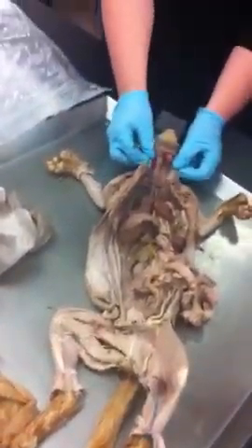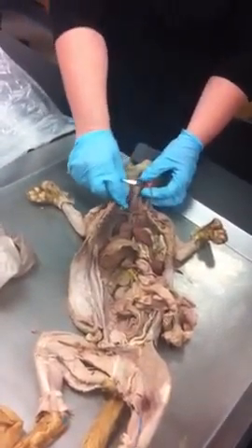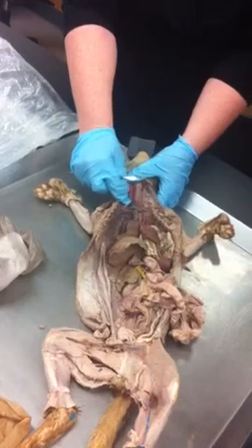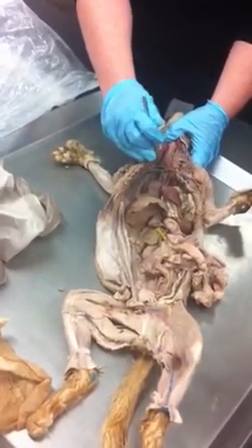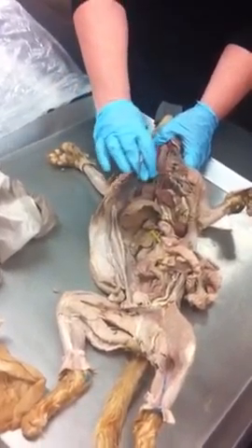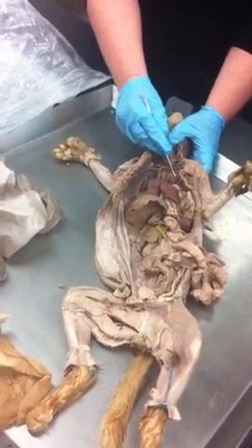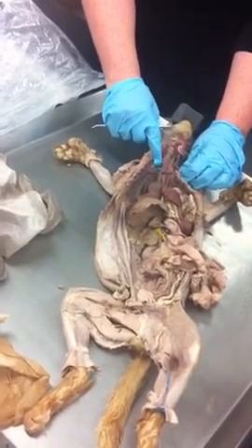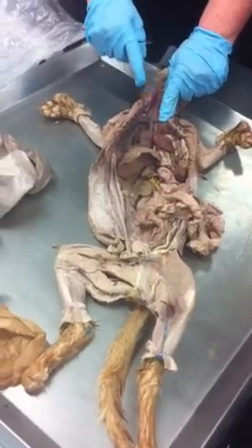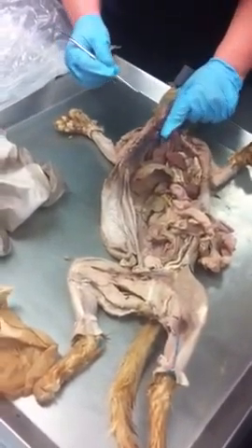What are these veins? Jugulars. Yeah, and make sure you say external jugular. The internals are going to come and join with them too, but we'll ignore those for now. So when the external jugular comes together with our subclavians, what do we get? That's going to be the brachiocephalic vein. Yeah. So remember, you have one brachiocephalic trunk, but two right and left brachiocephalic veins, and then they merge to form the superior vena cava.